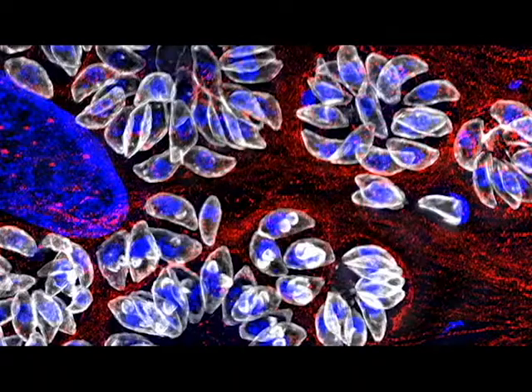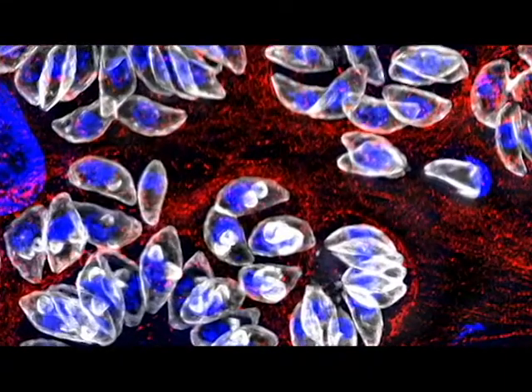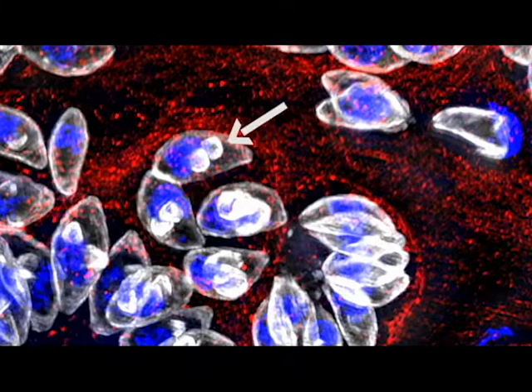In this image, we can see a single human cell infected with hundreds of parasites. We can see the human cell nucleus in blue here, the skeleton of the human cell in red, and in white outlines each individual parasite. In these bottom ones here, you can see the parasites are starting to divide. Two daughter cells are forming. These will elongate and eventually burst out of the mother, killing the mother cell. Because two daughters emerge from each mother, they tend to grow like this, forming petals of a flower.